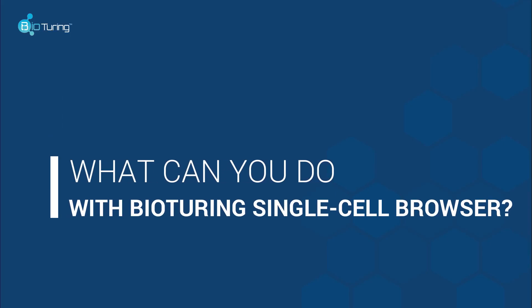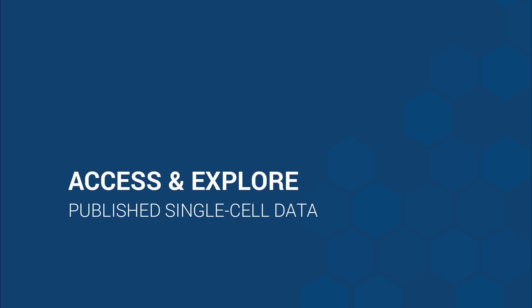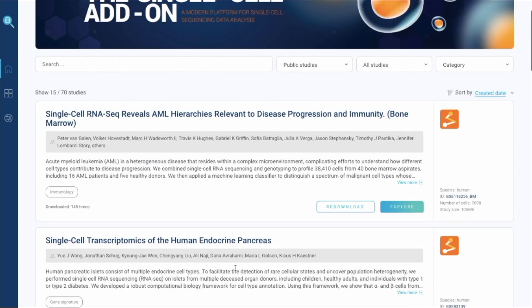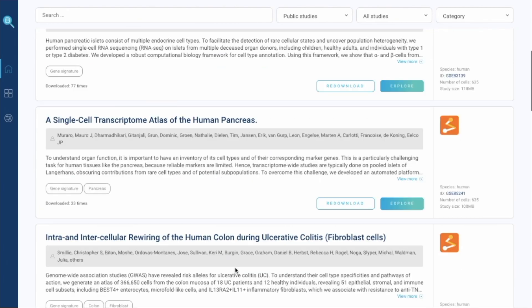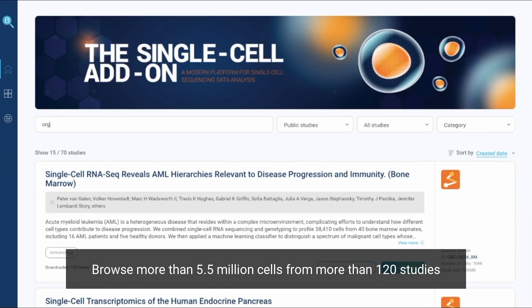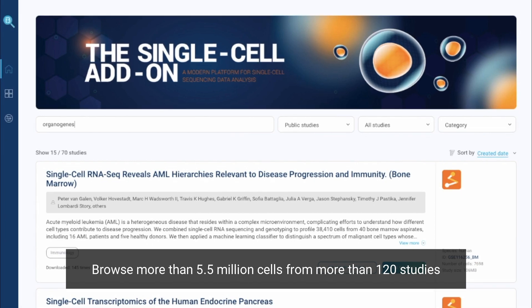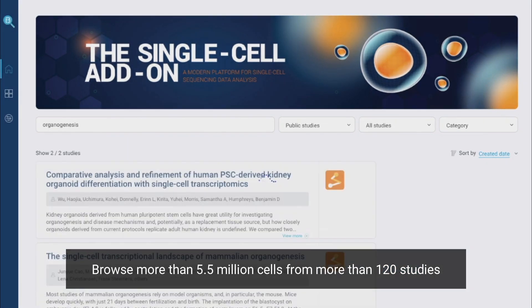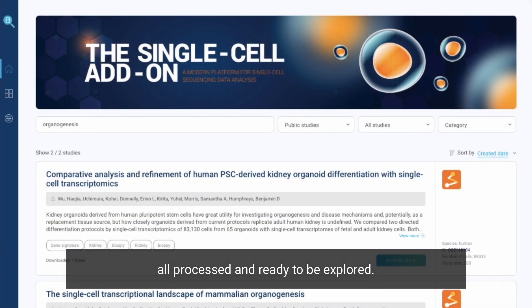What can you do with BioTuring Single Cell Browser? Instantly access and reanalyze single cell sequencing data from published studies. Browse more than 5.5 million cells from more than 120 studies, all processed and ready to be explored.